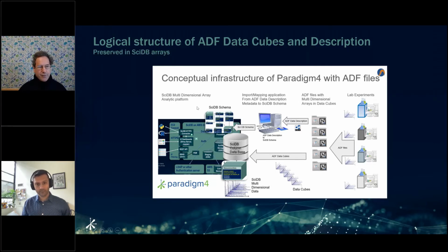So it's really a tribute to this idea of starting with matrices and preserving them all the way through into the analytical platform. So the lab experiments as a matrix, the ADF files as multi-dimensional arrays, data cubes, the importing and mapping of the ADF data description metadata to SciDB schema, and then the analysis that's done in SciDB.